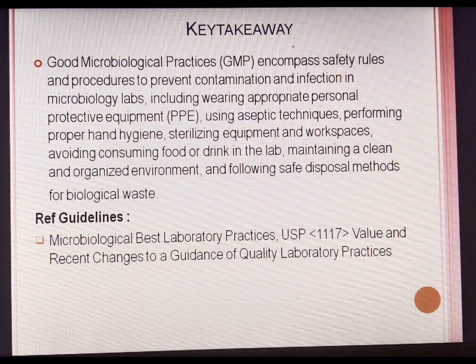Reference guideline: Microbiological Best Laboratory Practices, USP Chapter 1117, value and recent changes to the guidance of quality laboratory practices.